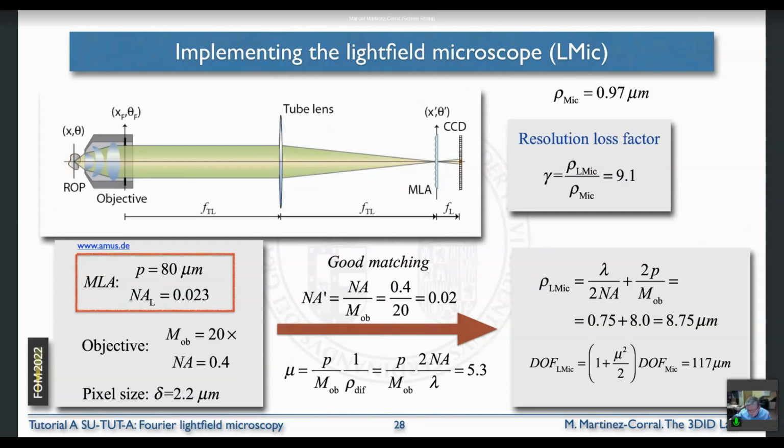They have good microlens arrays. Their stock is good, and they can provide you approximately anything you need. So remember, we need to match the microlens array with the objective. Let us suppose that we use this microlens array from the stock of this company. We use this objective I told you before, and this pixel array.